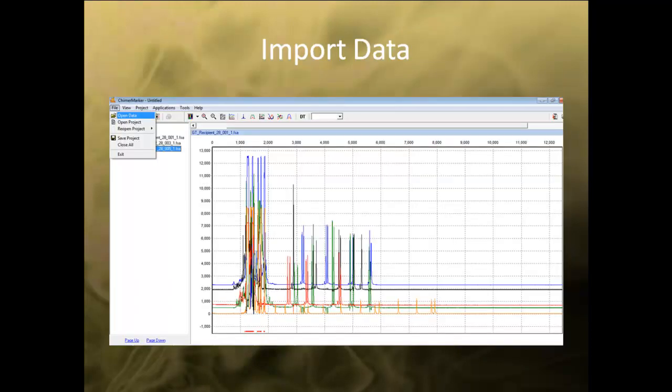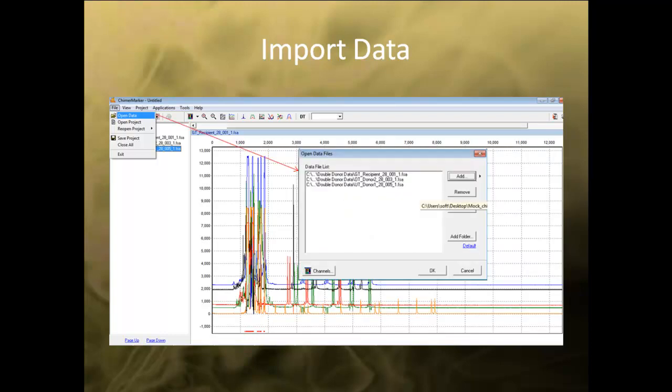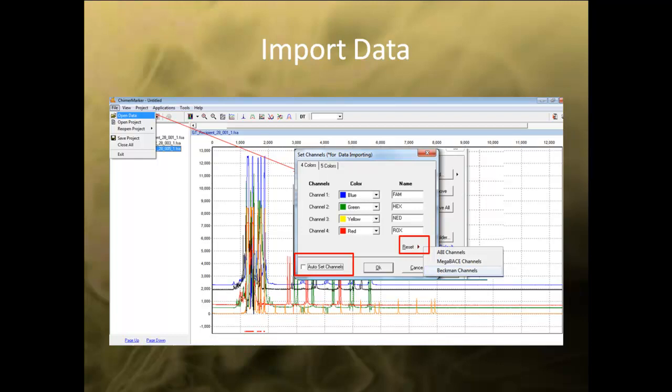To import data into ChimerMarker, use the File drop-down menu and select Open Data. In the dialog box, click the Add button to import samples into ChimerMarker. You can also remove files by selecting the sample and clicking Remove. For Beckman data, please select Channels before importing your data and deselect Auto Set Channel, then click Reset to select the appropriate dye color orders. After selecting all the desired files, hit OK to import the files.